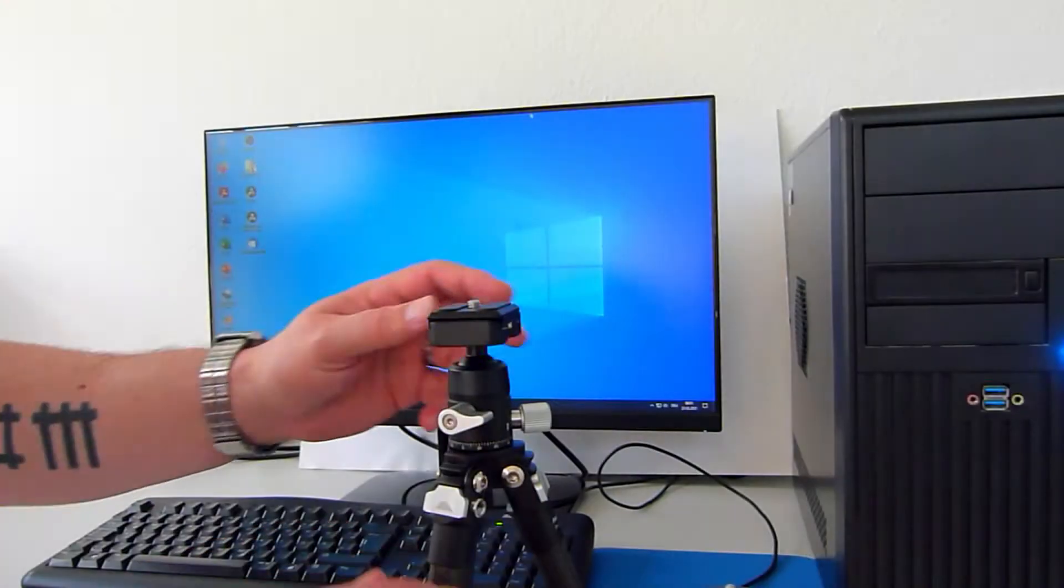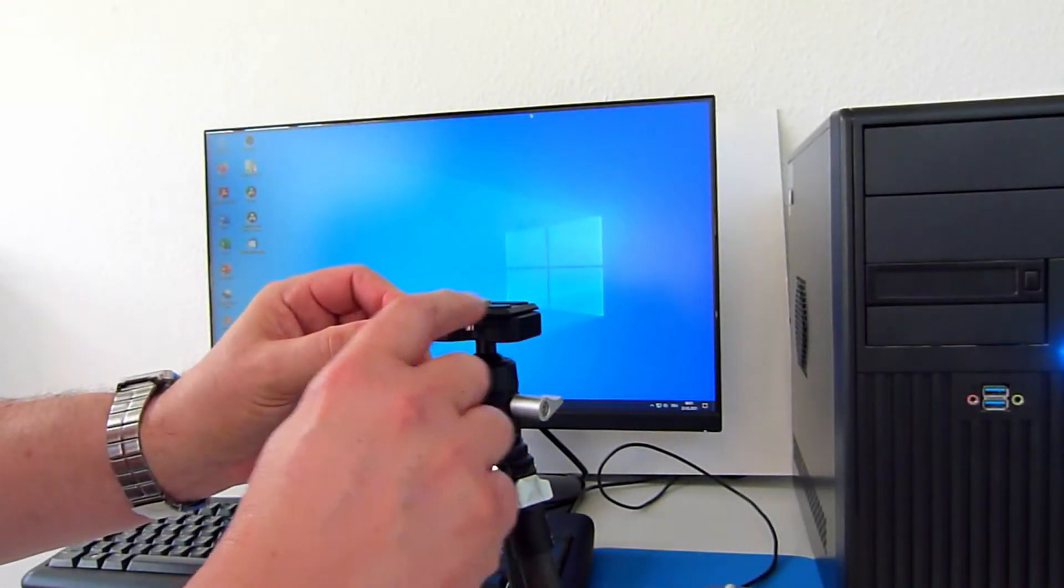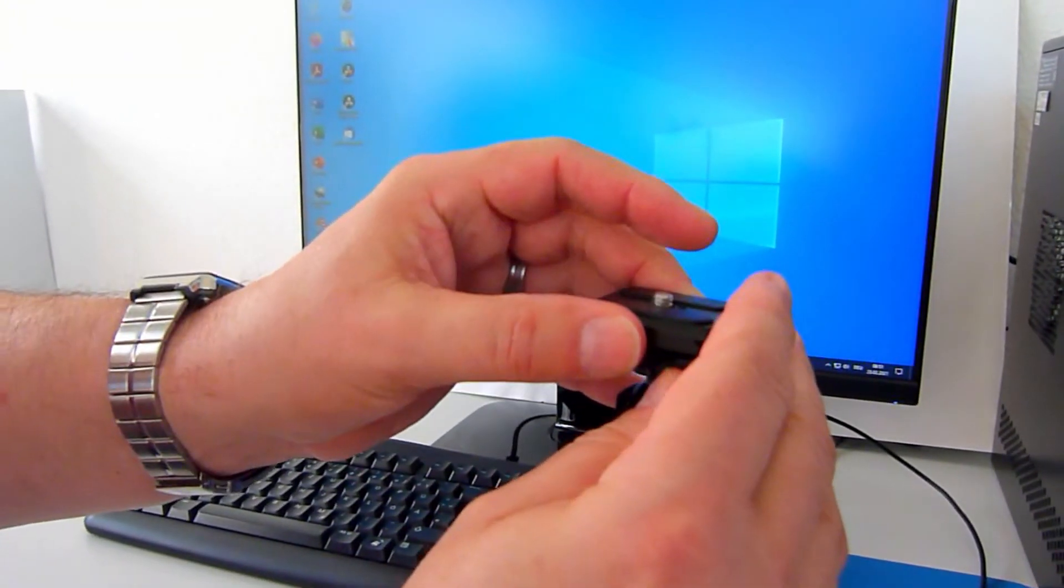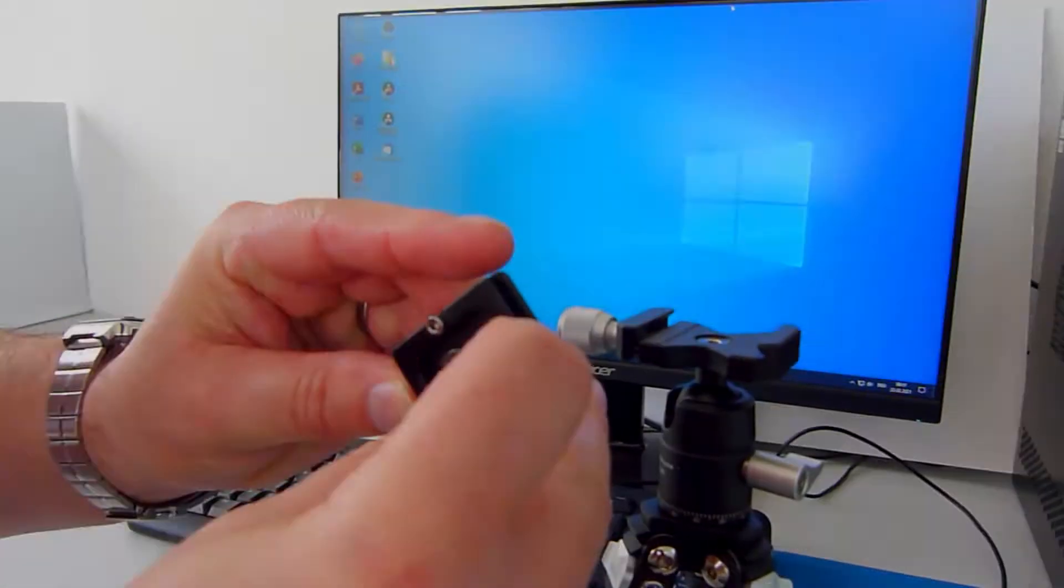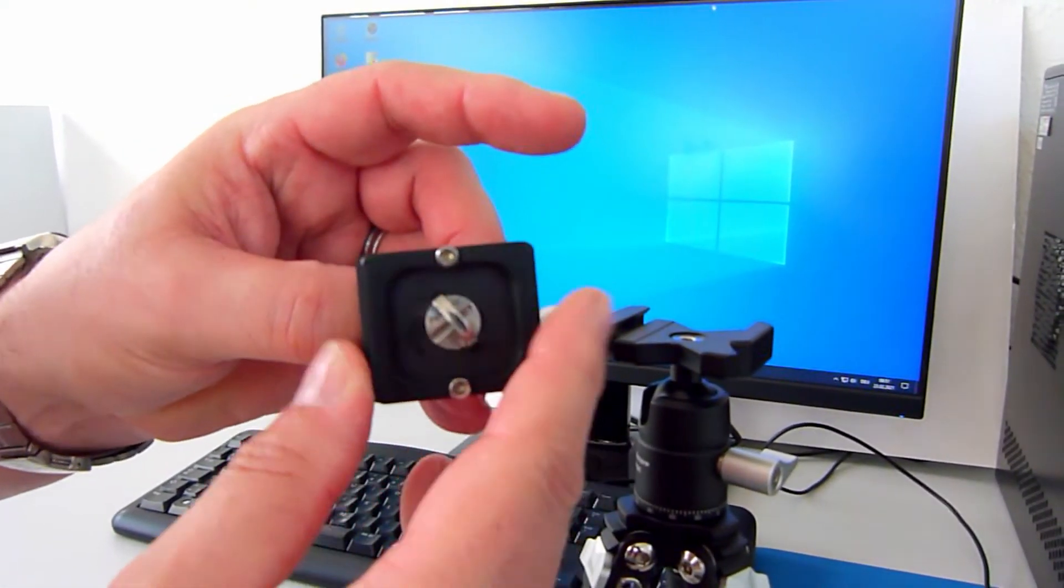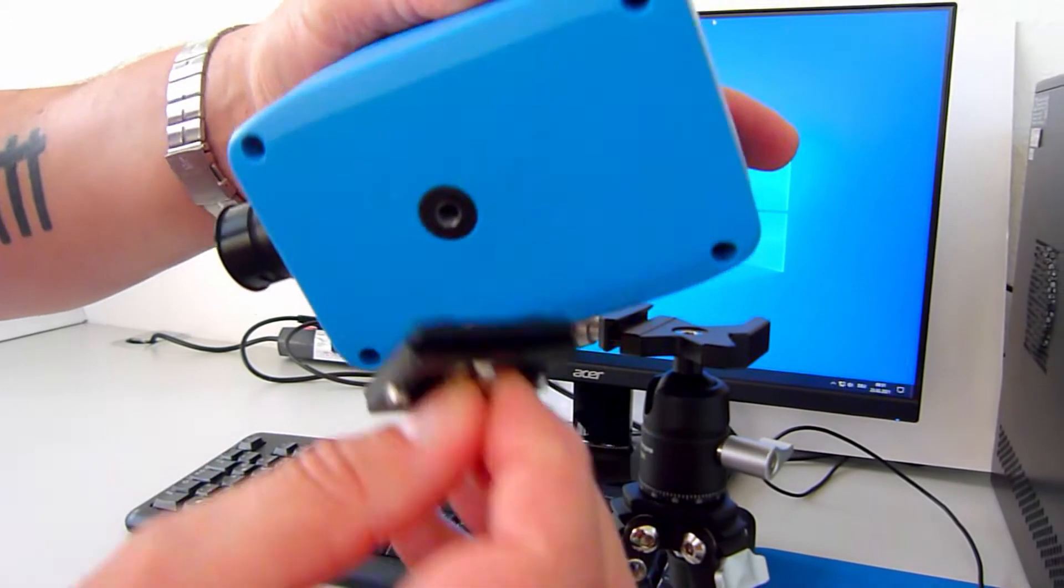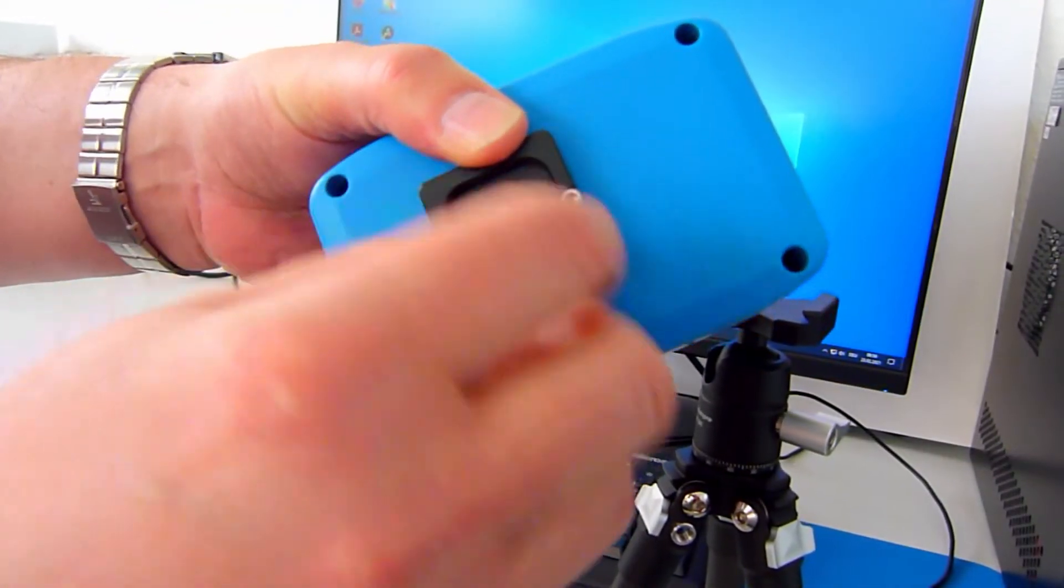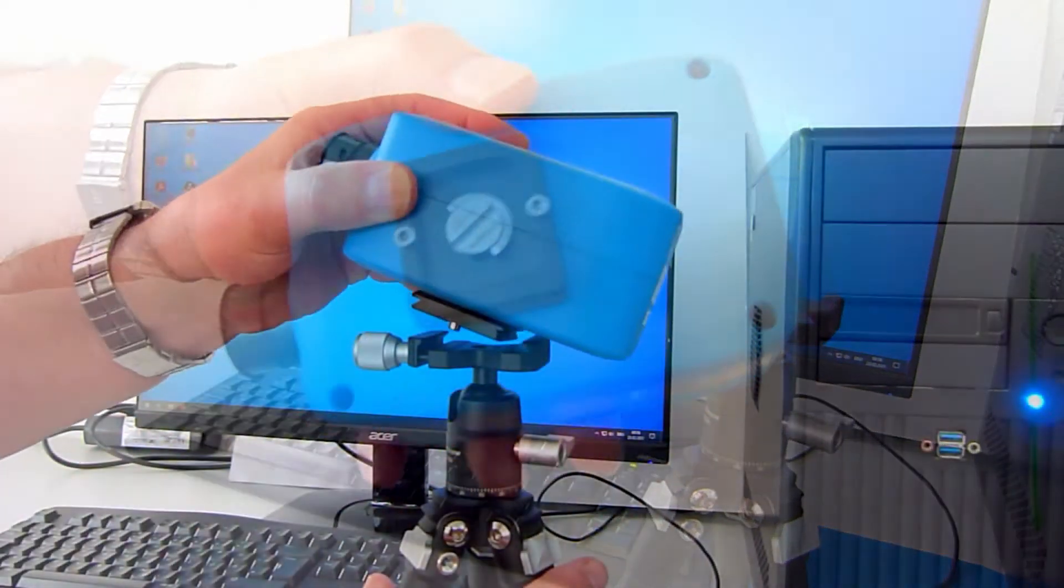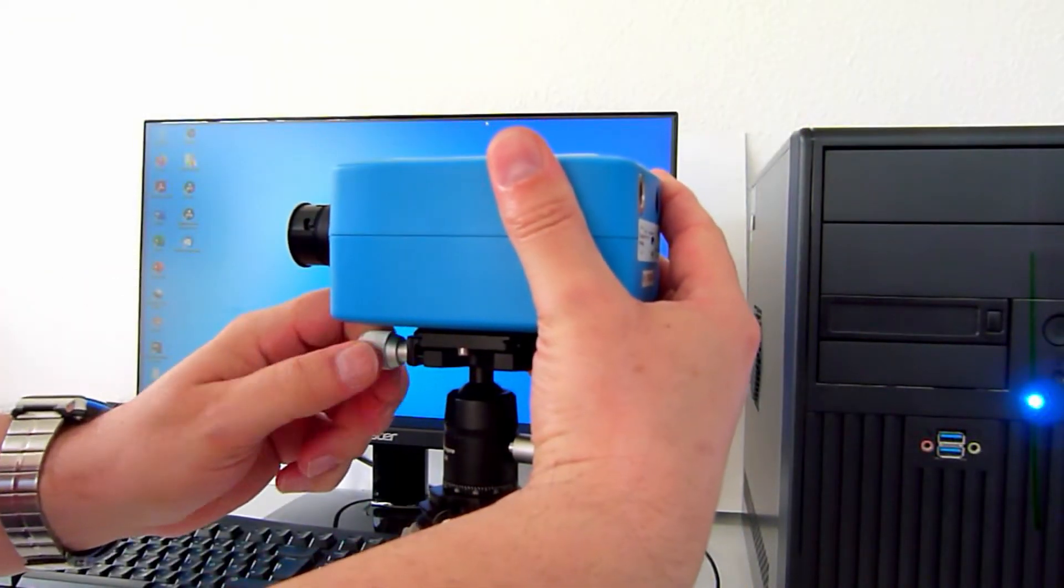To mount the device onto the tripod, turn the screw to open the device holder and remove the mounting plate. Screw it to the bottom of the device, then tighten the screw to secure the unit to the tripod.